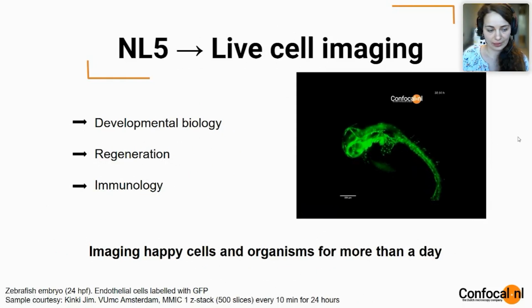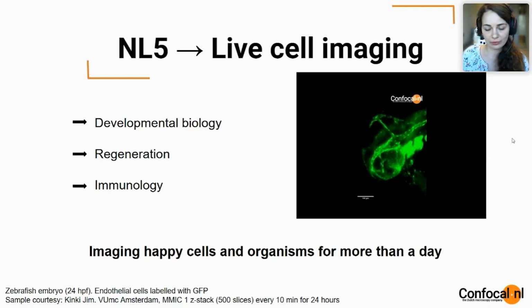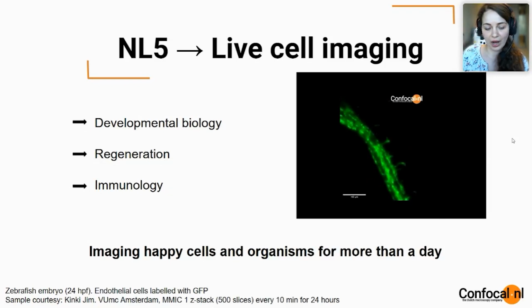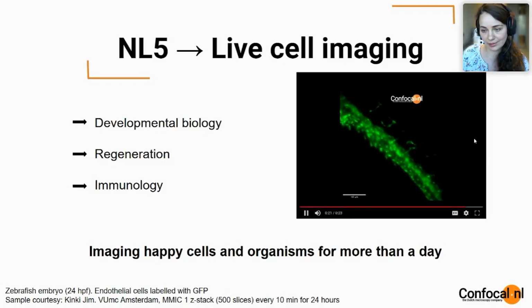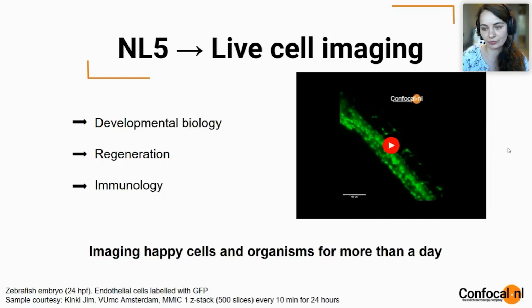This is a zebrafish embryo, which was imaged with a 10x objective to capture all the information we need. And it was imaged for more than 24 hours. You can see the nice endothelial cells. And even after 24 hours, there is no sign of phototoxicity.